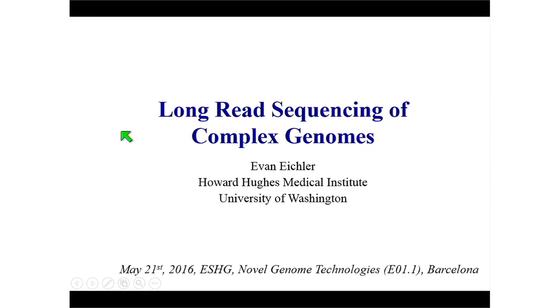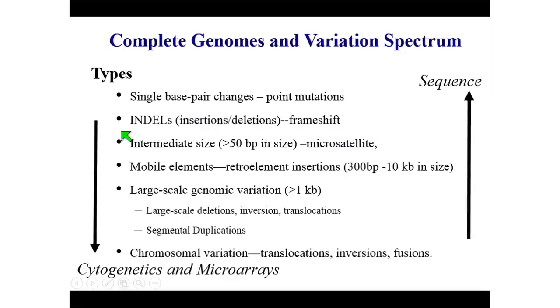I'm going to be sharing with you today some of the advances that have been made, we think, with respect to long-read sequencing, particularly from a focus on single-molecule real-time sequencing.